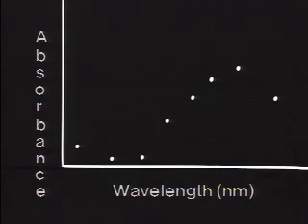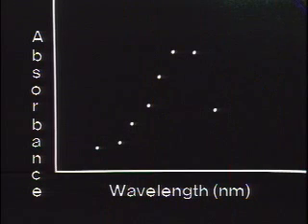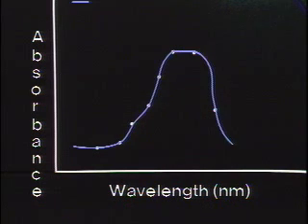The wavelength, usually measured in nanometers, is plotted against the absorbance to give the spectrum of the solution. The wavelength that corresponds to the greatest absorbance is usually selected for the subsequent Beer's law measurements. If the solution is too concentrated, the maximum absorbance of the spectrum will be infinite over a range of wavelengths. In these cases, the solution must be diluted in order to obtain the maximum absorbance for the second step of the procedure.